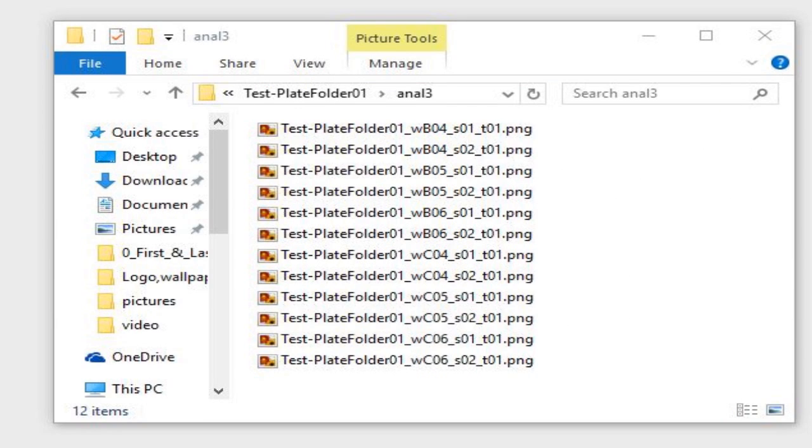It is worth noting that image and metadata files must follow the naming convention of plate name, underscore, W, row and column of the well, underscore, S, a number identifying the image, etc. Note: plate name is the name of the plate. It must be the same name as used for the plate folder. The first character of the plate name must be a letter from A to Z. All the characters can be used for the plate name except underscore, asterisks, and white spaces. Please read the help documentation file provided with the software to find out all about the nomenclature rules.